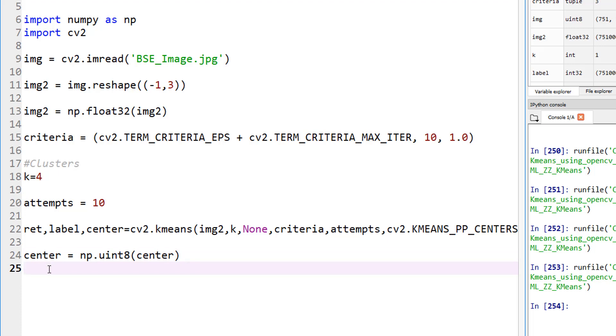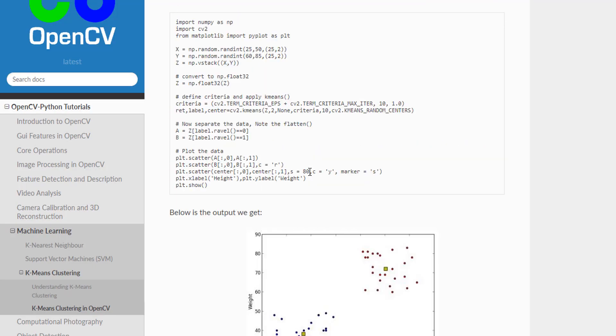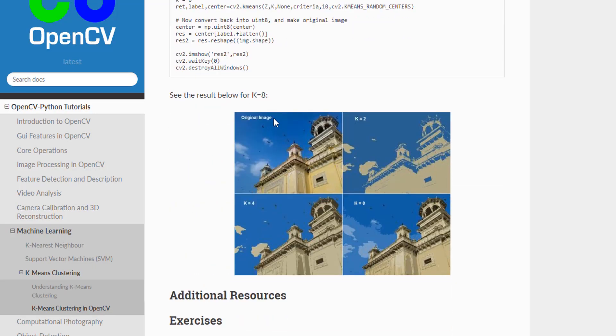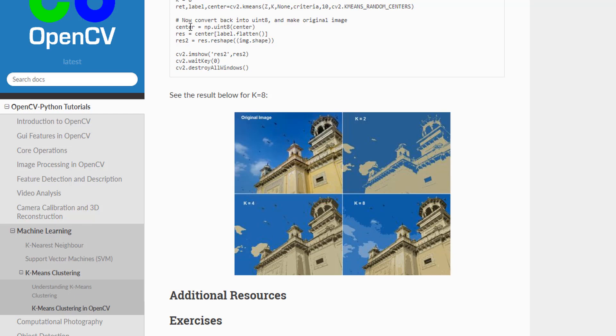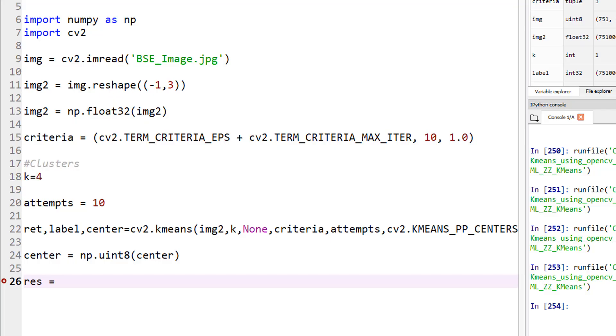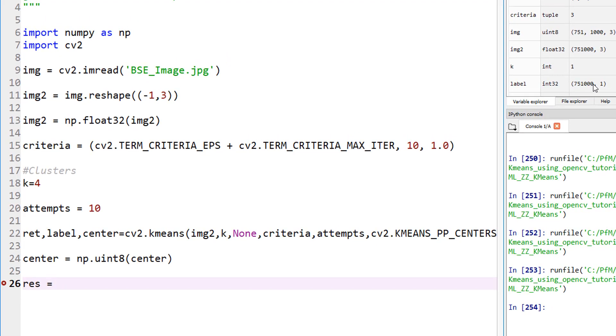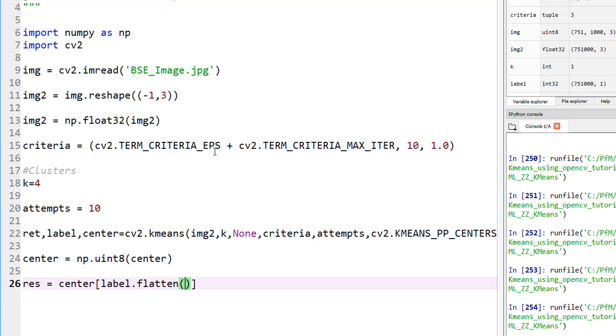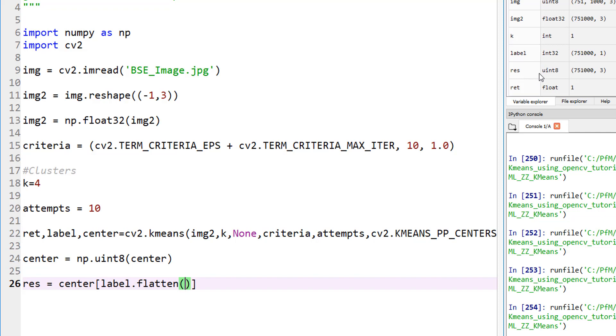Now we can go ahead and plot it. Also let's look at the labels so we can plot this. The way we do our labels is, my res equals to center again. By the way, in case you need more explanation, it's all right here. Convert back into unsigned integer 8, which is exactly what I did. Now let's flatten the labels and then reshape them. If you look at the label here, the label is 751,000 by 1. That's an nd array. Now let me take this center, label and then flatten.